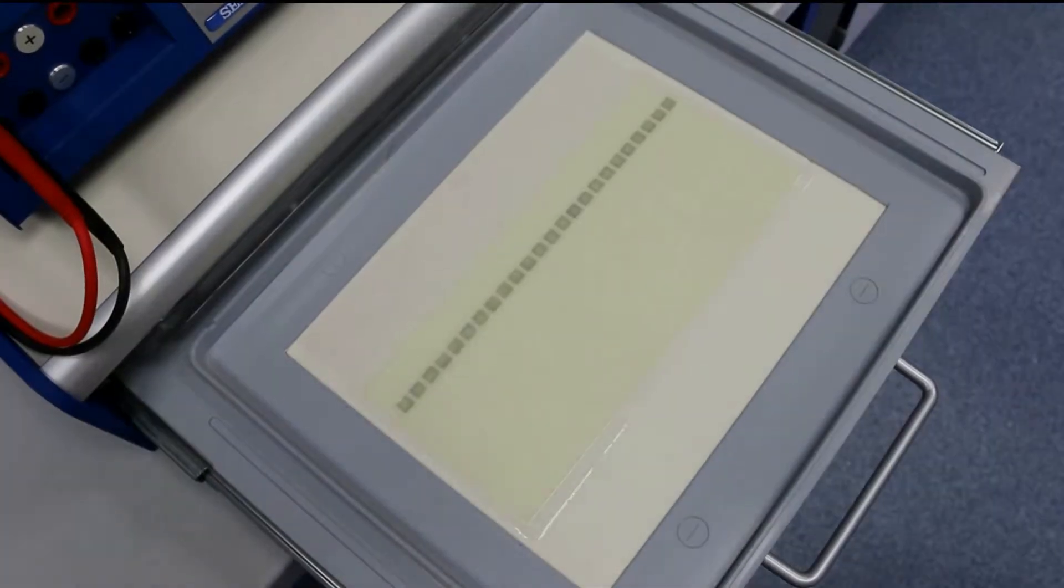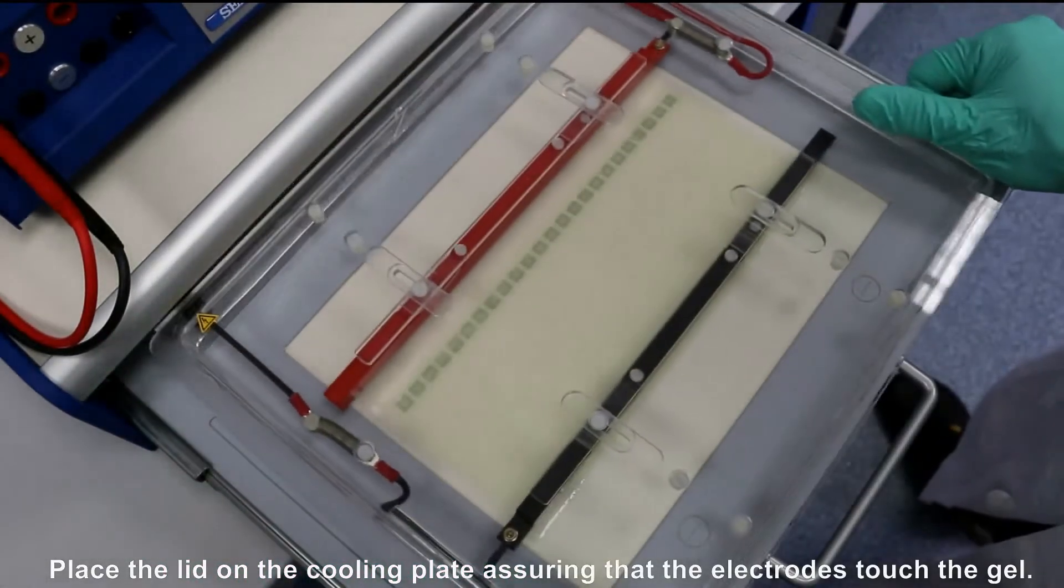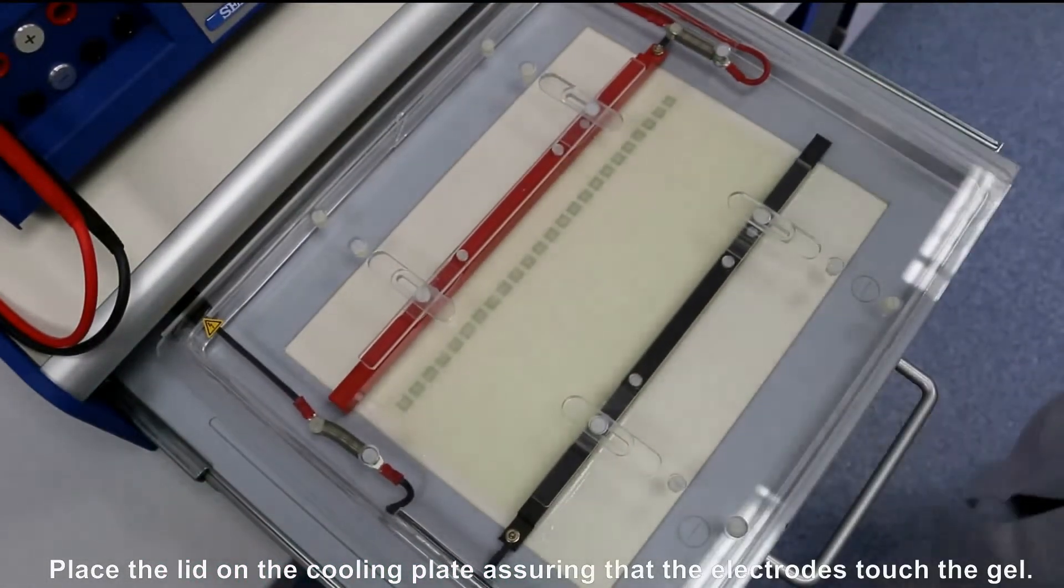Place the lid on the cooling plate. Assure that the electrodes touch the gel surface.